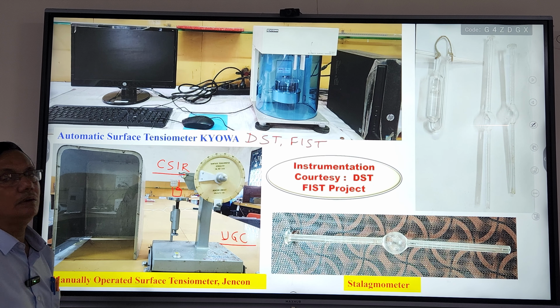Now first I will explain the difference regarding the Wilhelmy plate method, because this is a very old method. The great German scientist Ludwig Wilhelmy, in 1863, actually discovered this method. And you know that here a thin platinum plate is vertically immersed into the liquid.